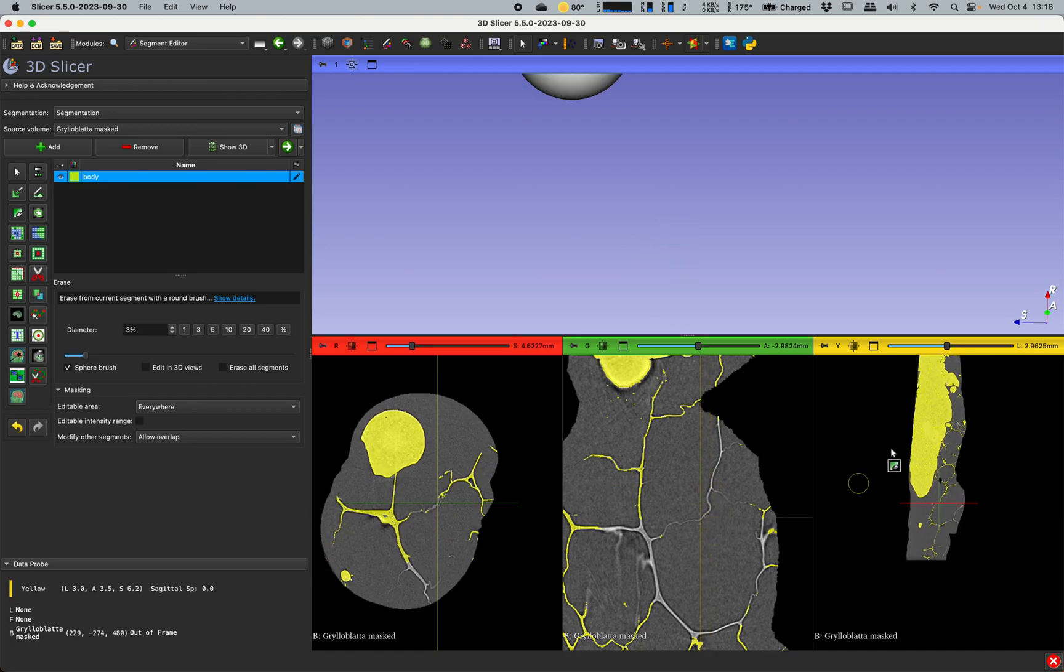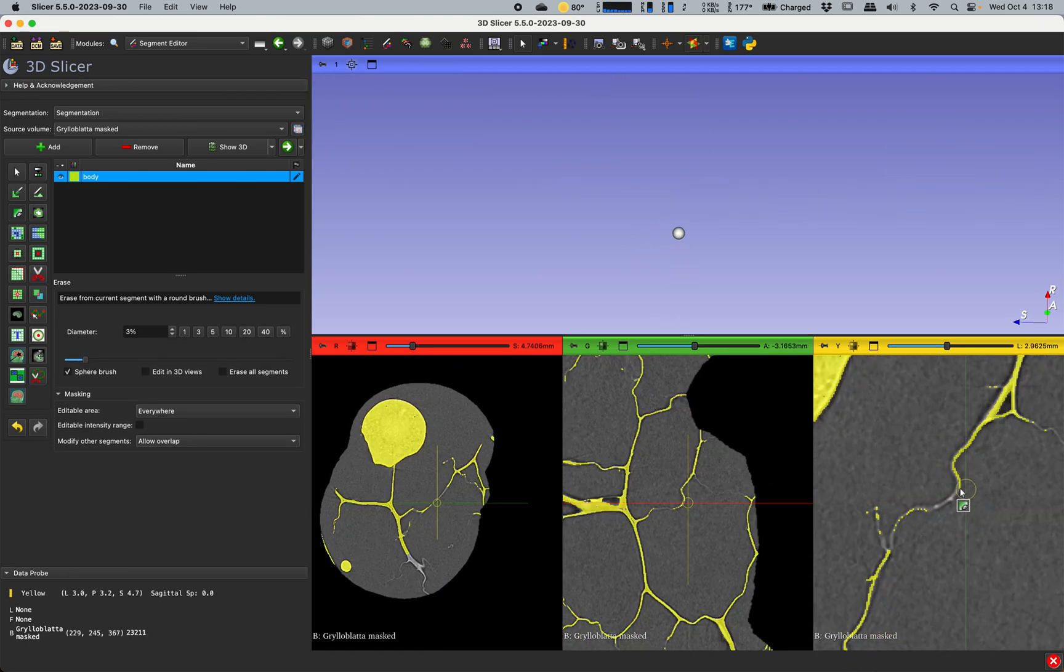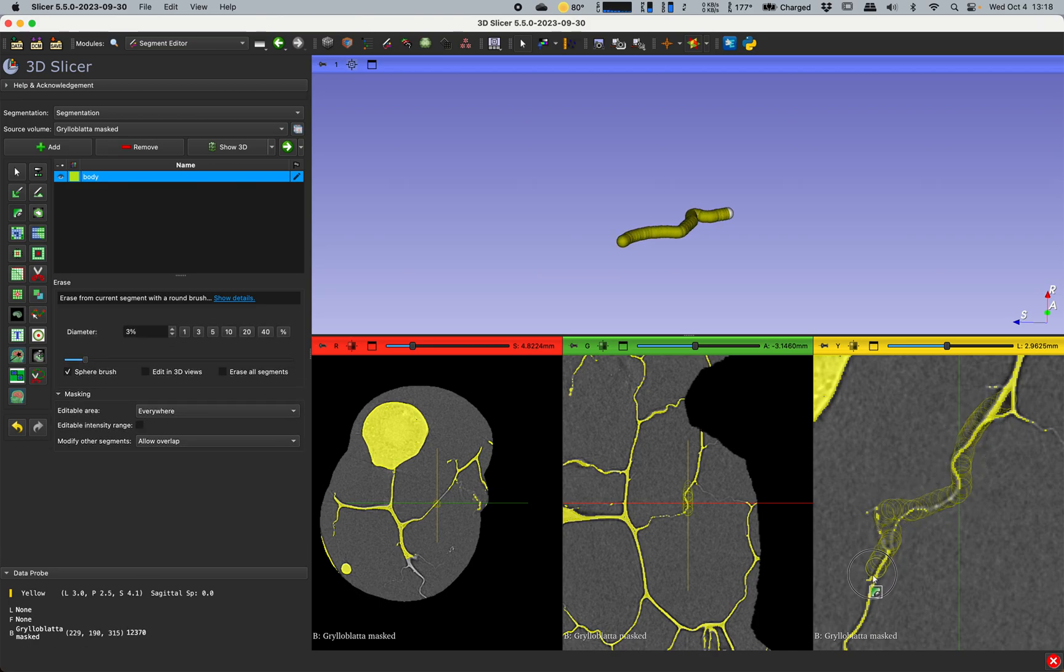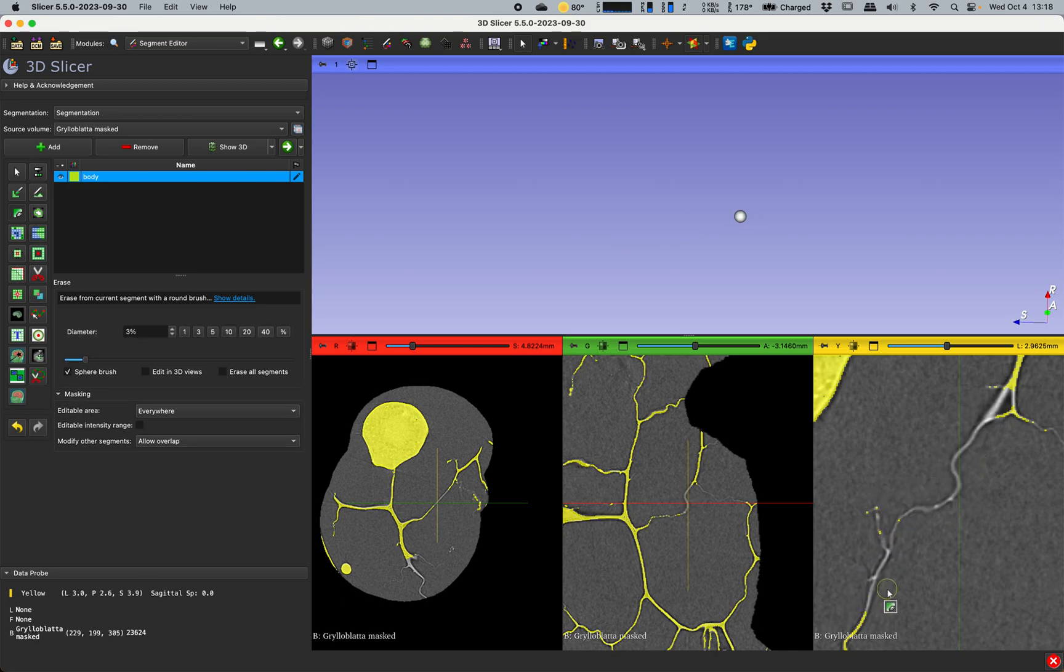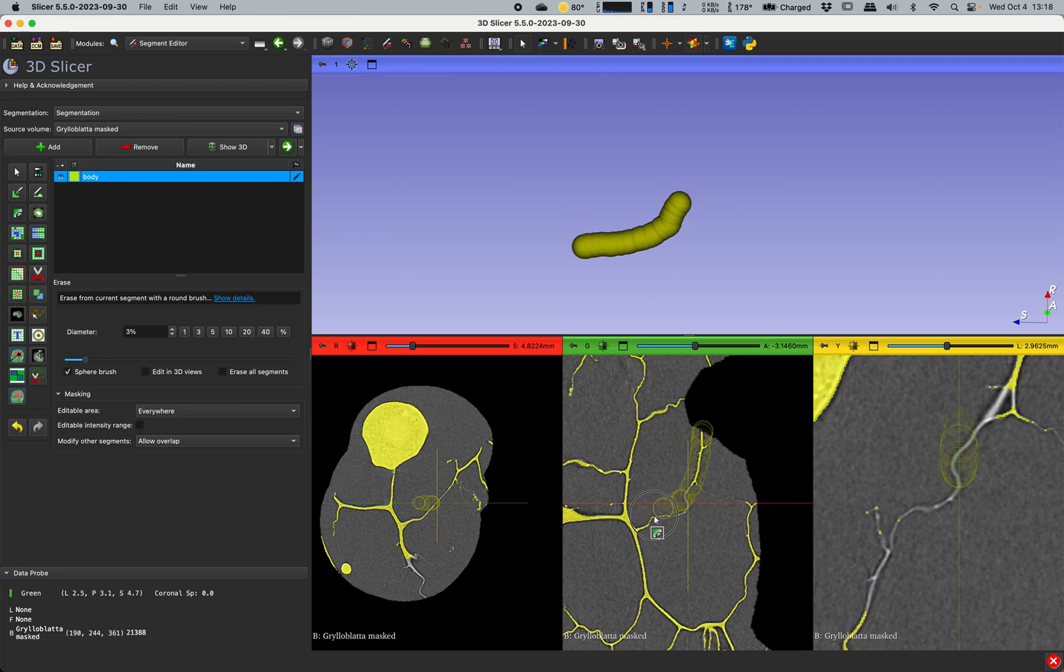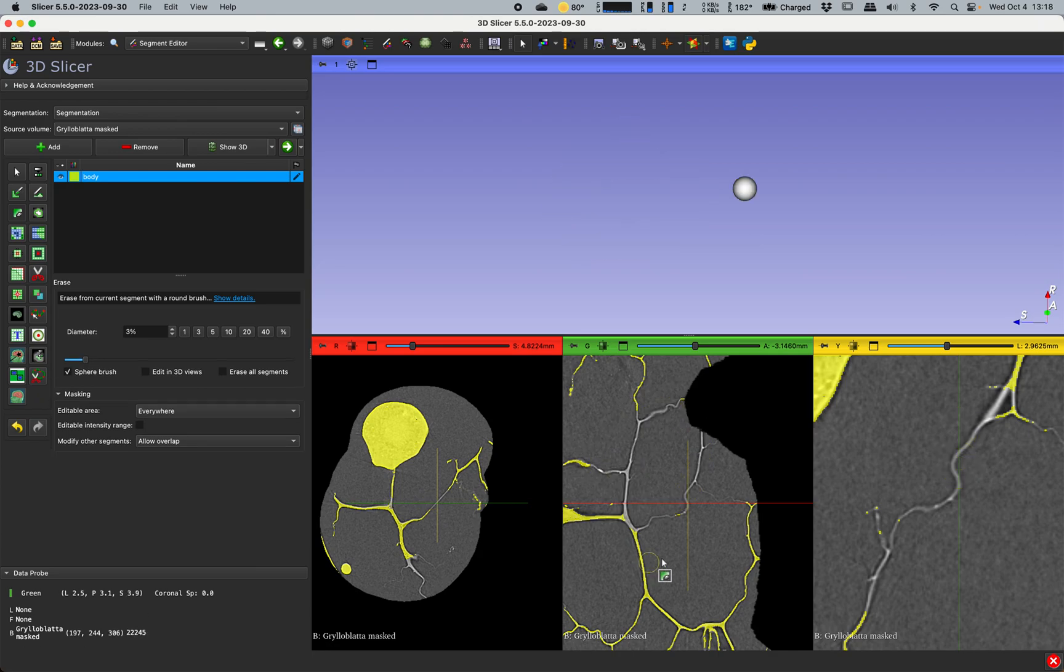And you can kind of see I'm erasing in here, I'm erasing in here, and so on. This can be a really easy way, if a bit time-consuming, to get rid of things that you don't necessarily want to have in there.